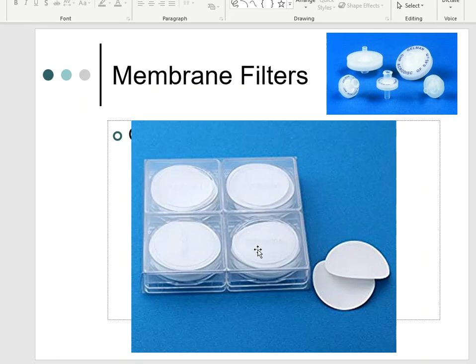Most of the time, these things are separated by pieces of paper, and people will actually try to use the paper as the filter. I've seen that happen before, because you're so used to and trained into talking about filter paper that, with the protective top and bottom layer that's there to separate the membrane filters from each other, people believe that is the filter they should be using, and it is not. So you just have to be careful with that. This is more plasticky feeling. It is not paper, and the paper pieces are only there to separate the filters from each other.